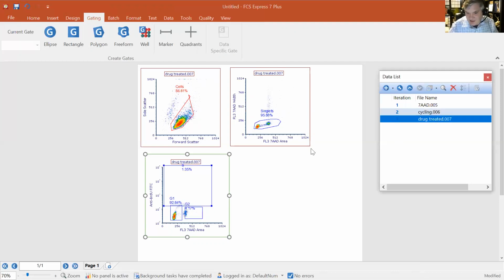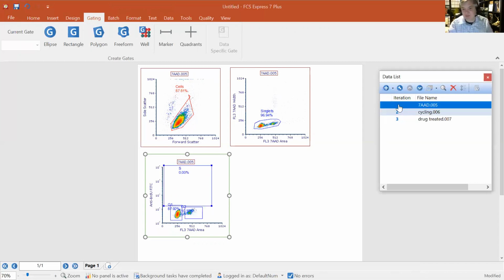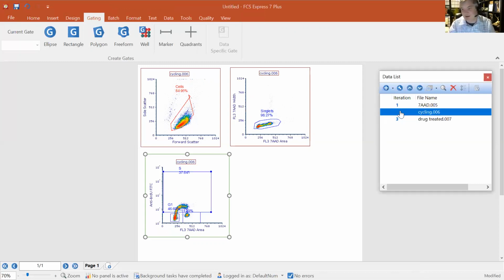And again, I'm not super interested in my bivariate analysis today. We're more interested in the modeling. So I'm just going to do this off the cuff. But again, that's what I would probably do for my bivariate manual gating.